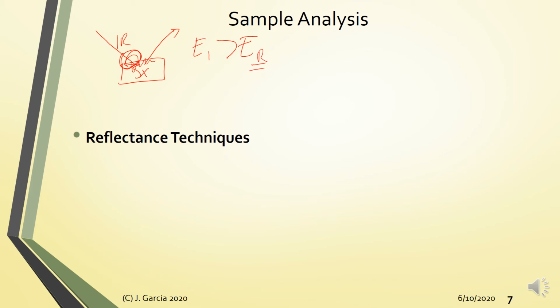So analogous to your absorbance and transmittance. However, if you want to quantify or relate this with weird numbers though, you need to express this in terms of absorbance. Okay, so well, not to worry, because your reflectance is actually related to your absorbance via the so-called Kubelka-Munk equation. Alright, so just research this.